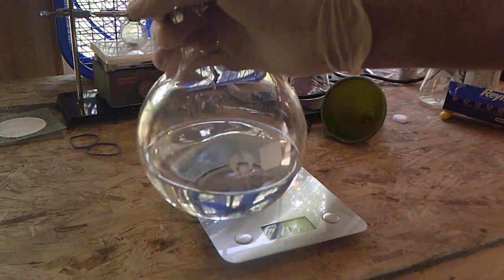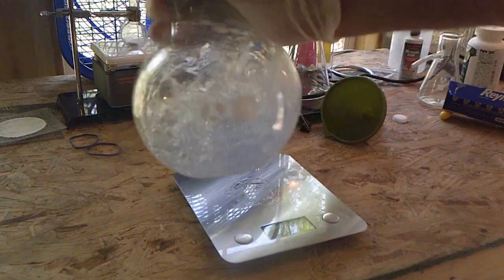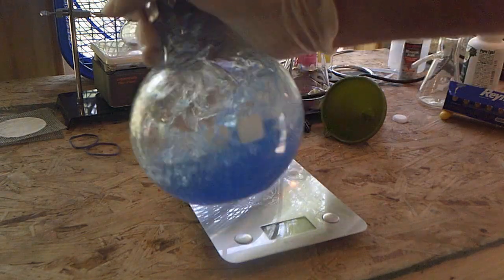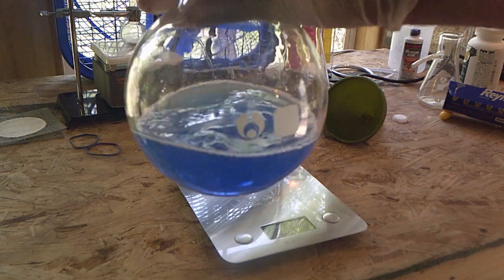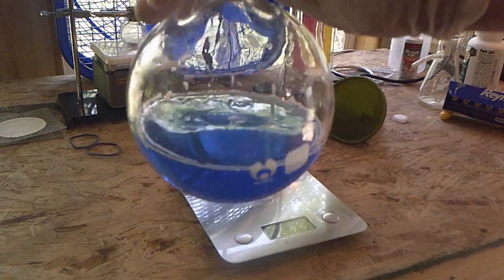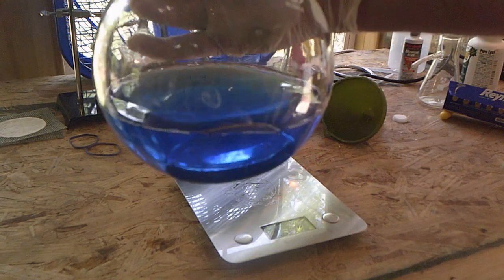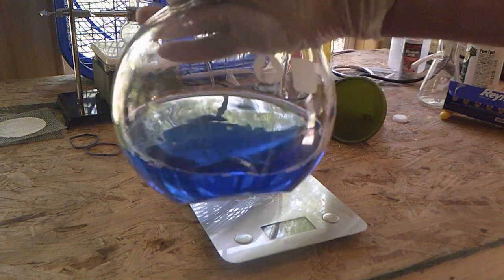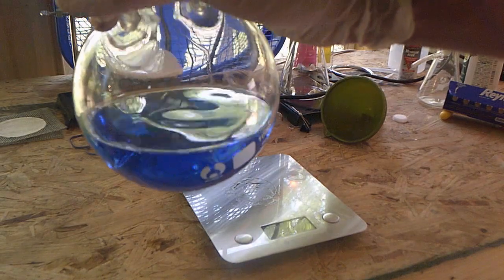Let's do it one more time. So from clear to blue, absorbing the oxygen that is in the container into the solution. The more I shake it, the more blue it'll get. And now, as the oxygen is reabsorbed by the dextrose and leaves the solution, we'll go back to a clear state.